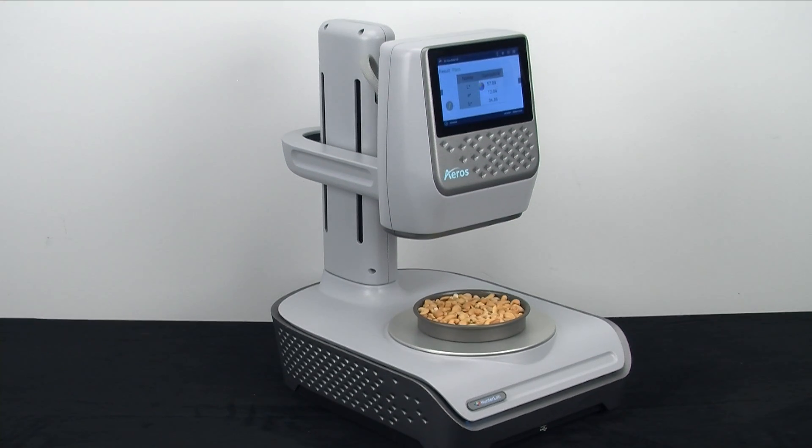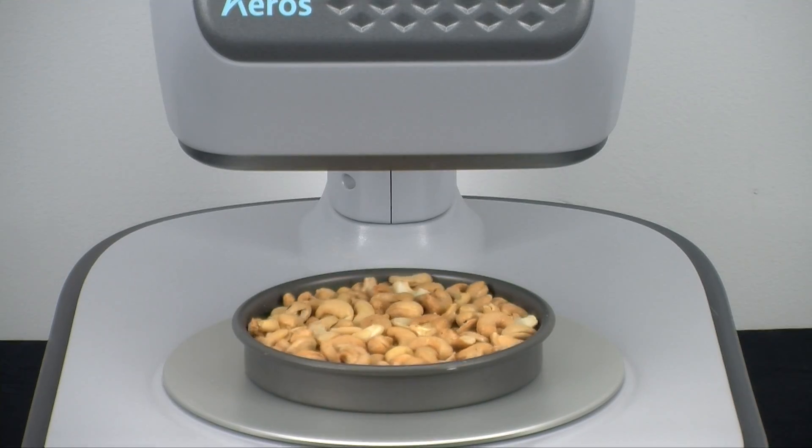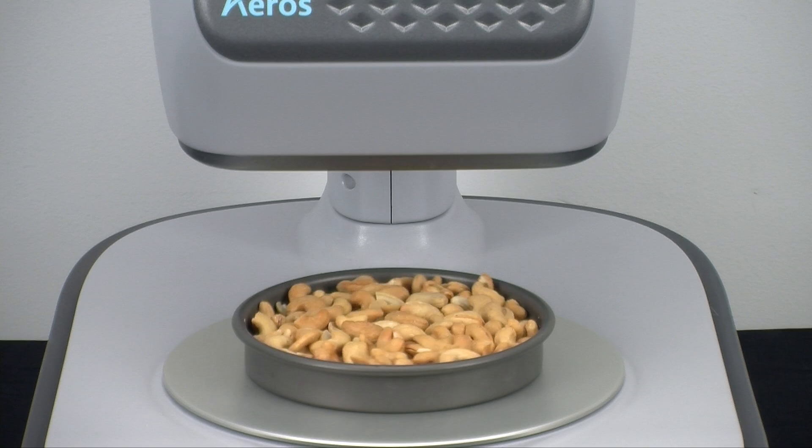The remarkable Aeros is designed to help you measure the most challenging of samples, those with irregular shapes and inconsistent surface areas. Aeros can not only easily color measure these type samples, but also in varying sample containers.